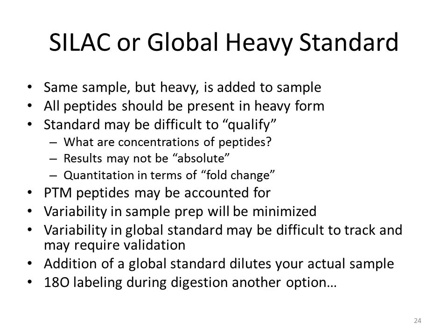Post-translationally modified peptides may also be accounted for, whereas in working with synthetic peptide standards, they usually cannot be unless they've been synthesized that way, which is challenging. Phosphopeptides, we know they can be made, but others may be a little more difficult. And then if you run out of your global standard, you have to make more, and then you have to requalify it. So that's also another challenge. And this goes for any standard. If you're running low on one, you just want to make sure that you generate more with enough time to overlap and make sure that they give similar or parallel performances before you completely convert over to the other one.